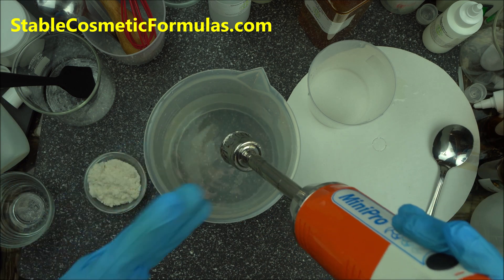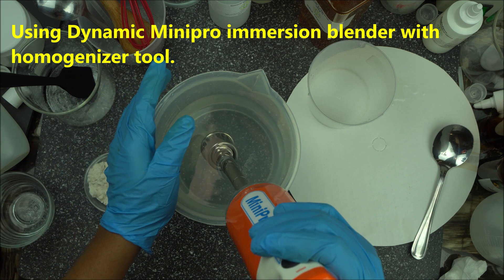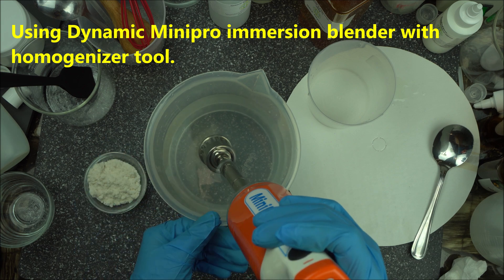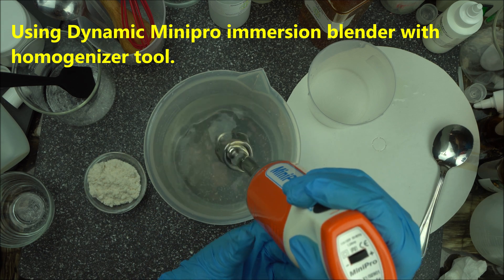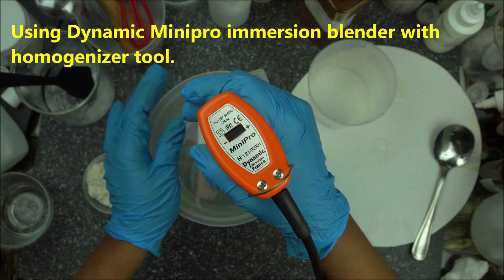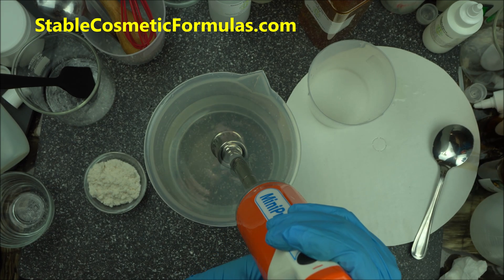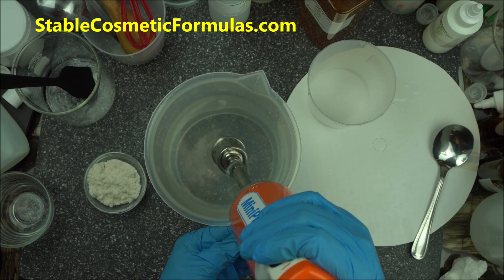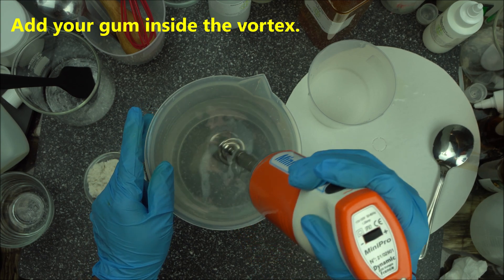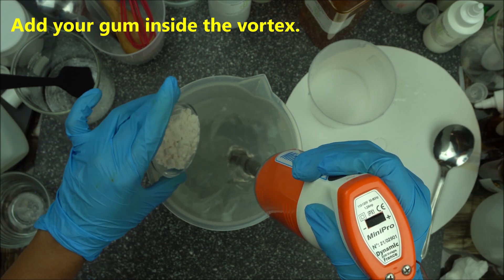This is what I use now for most of my blending, even for lotion. I want something portable I can take when traveling. Now start a vortex with your homogenizer — start it while inserting it into the water. Do not let it go to the bottom; any time you're using a handheld homogenizer, don't do that — it might damage the casing. Lift it up a little bit, just like I'm doing here, and then start the vortex. You're going to hide your gum inside that vortex — that's the trick behind it. Add a little at a time.